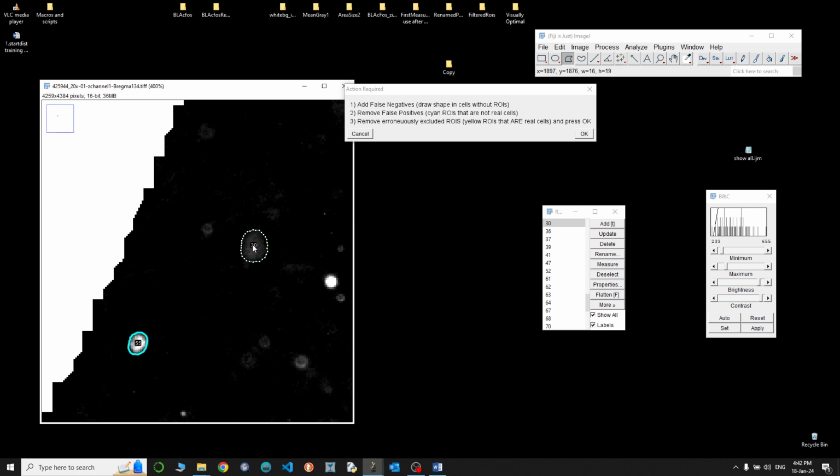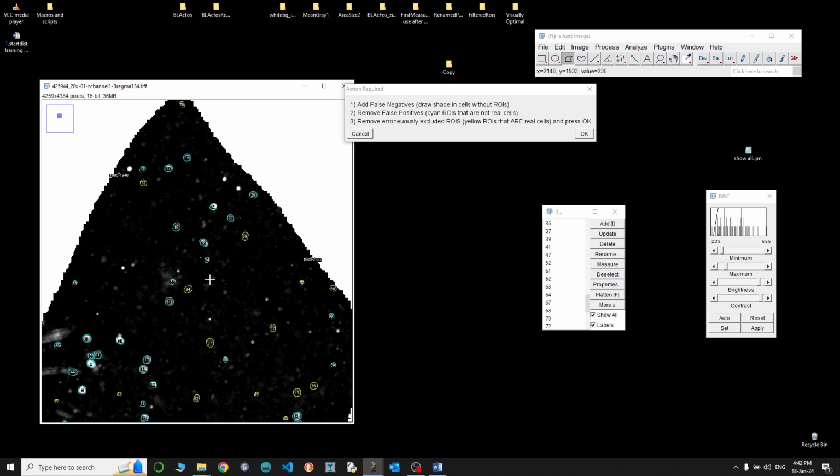Oops, I moved it. Can I move it back? So be careful with that to not do what I did. I think it goes, okay, something like that. So you click at the value, and when you click at the value, you'll see these dotted parts, and then you press S, and that's it. It's done.